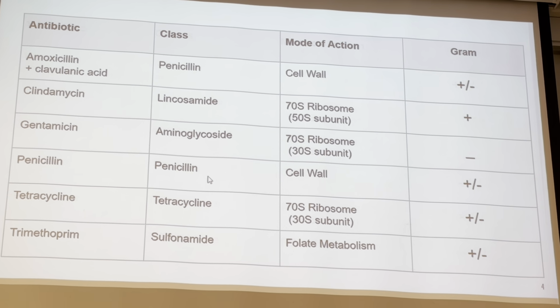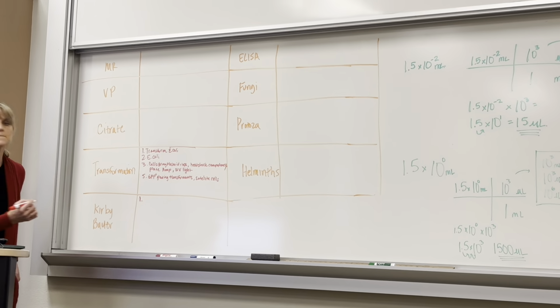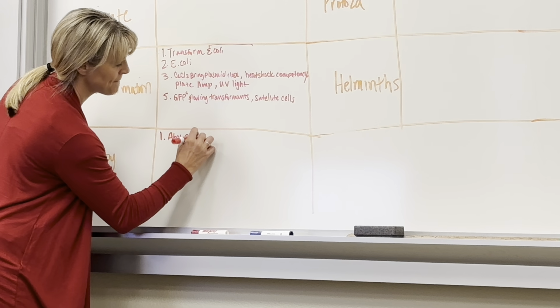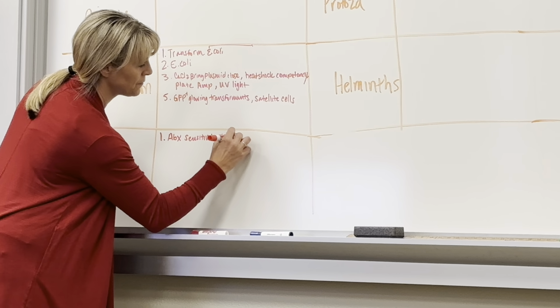Okay, so Kirby-Bauer, what is the purpose of Kirby-Bauer? To check for antibiotic resistance. Yes, antibiotic sensitivity versus resistance.